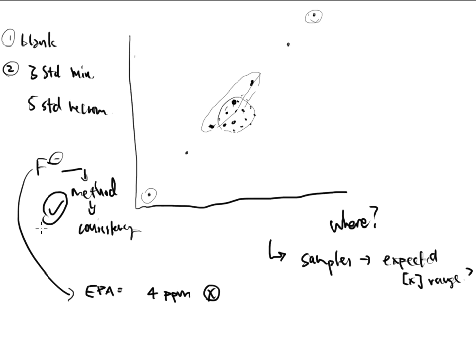So this really gives me an idea of where I should stop the fluoride standards. So maybe this one is my 4 parts per million. I don't need to really go any higher than that. If I do, then we've got bad news that we need to report, and it's just rarely going to happen. All right, well, if I do a little bit of digging, what I would find is that most of the time I'm going to see levels of maybe 0.75 to 1 part per million fluoride in drinking water. It could go a little bit higher, it could go a little bit lower, but on average, this is what I'm going to tend to see.